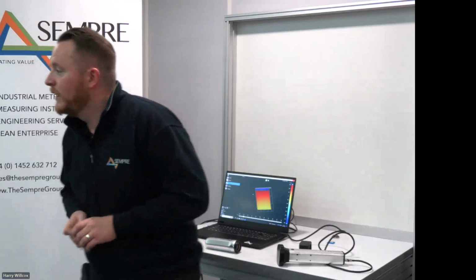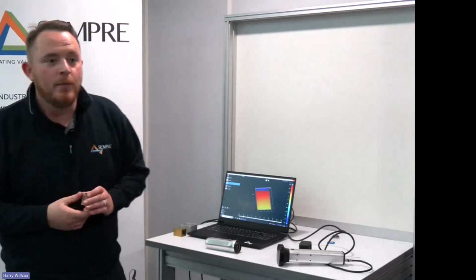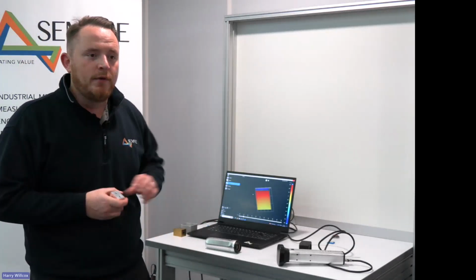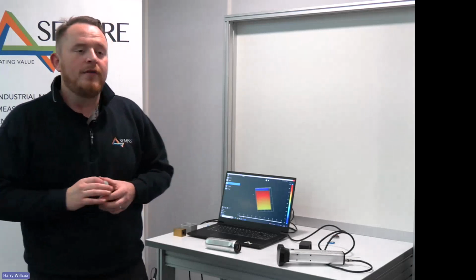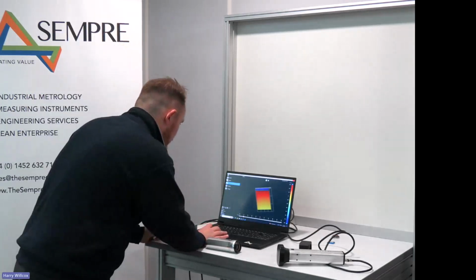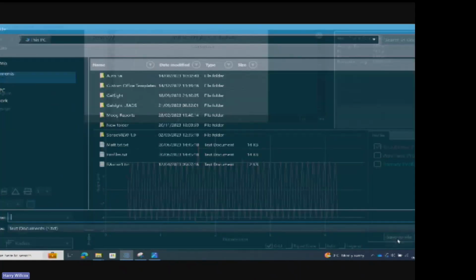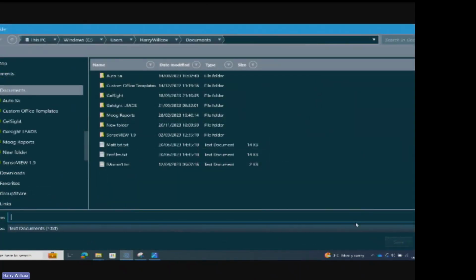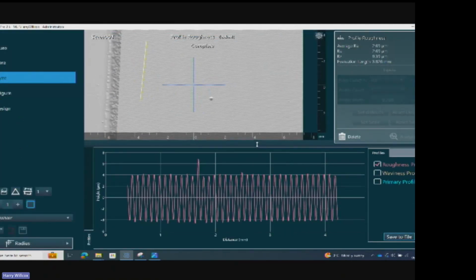Okay. Can you output the roughness parameters you measure to Python? Yes. Within the scan data, I've seen quite a few people output a TXT of the profile that we see within the software. As an example, I'll show you the data set. Here I've got my roughness measurement that we've taken. We can save that to a file, and effectively we get a TXT of the profile. From that data, we're able to run it through Python and do any of the other measurements that you might require.